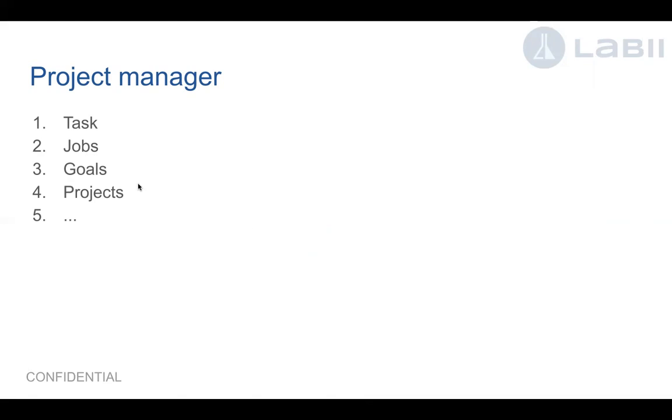For example, if you are a CRO, you need to manage all different kinds of things, different customers, and then you can just create a task. Like today at this particular time, I need to do this. The task can be associated with the experiment or the protocols or the samples. So every day you just need to check how many tasks or how many jobs I need to do.